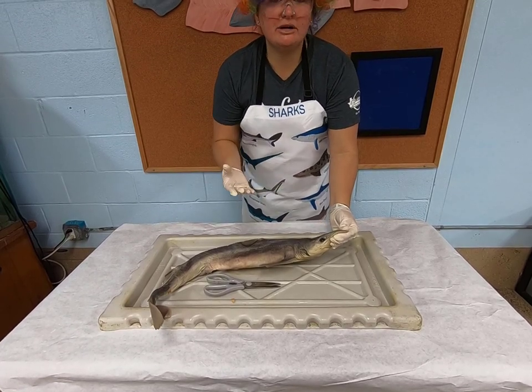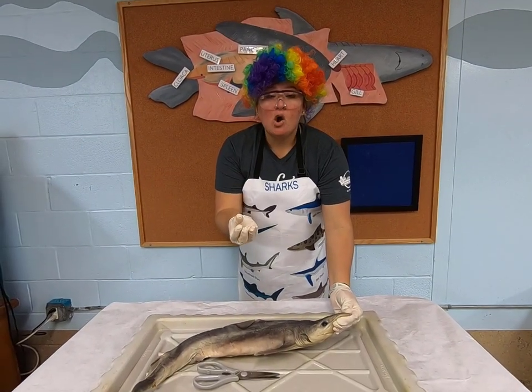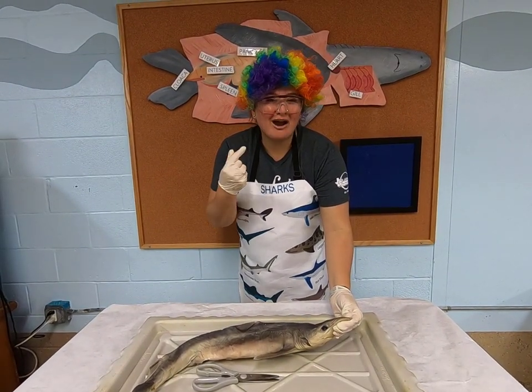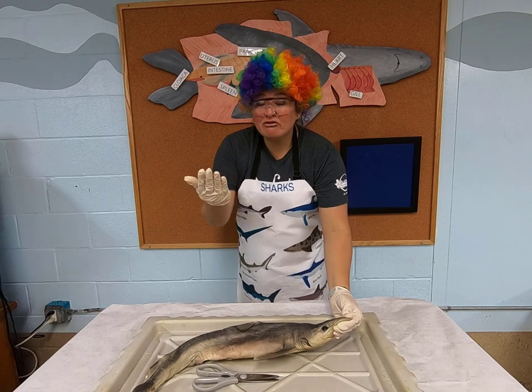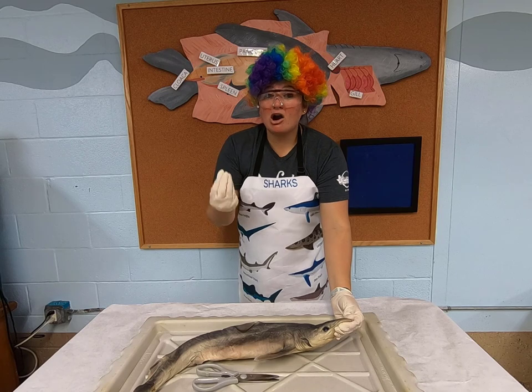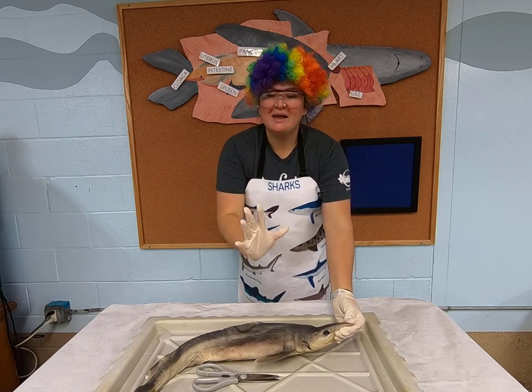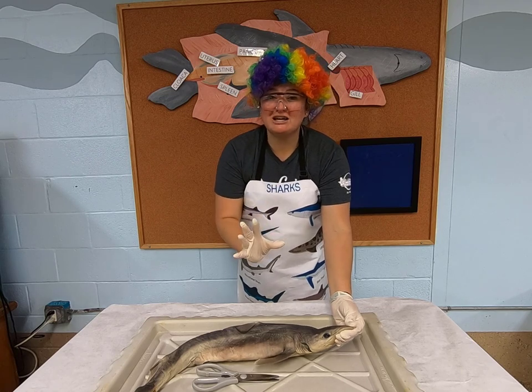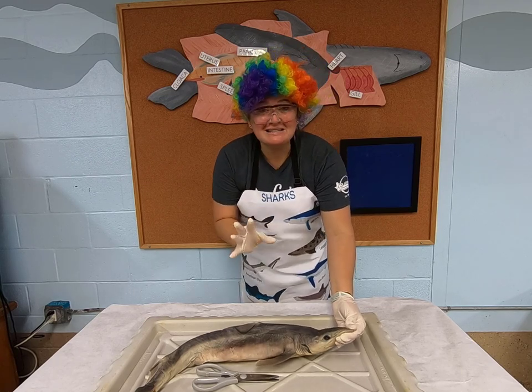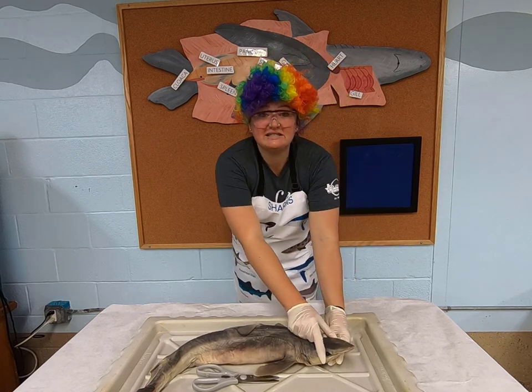So if you ever take a picture of your cat, you'll never have a red glare coming back to you. We have red eye because in the back of our eye, it's just blood vessels. So whenever your flash is going off, it's actually reflecting what's at the back of your eye. With sharks and these nocturnal vision animals, it actually is reflecting that tapetum lucidum, kind of like the green night vision goggles that you see on videos and in the military. So it's really cool that they have that. They have a really good sense of vision.